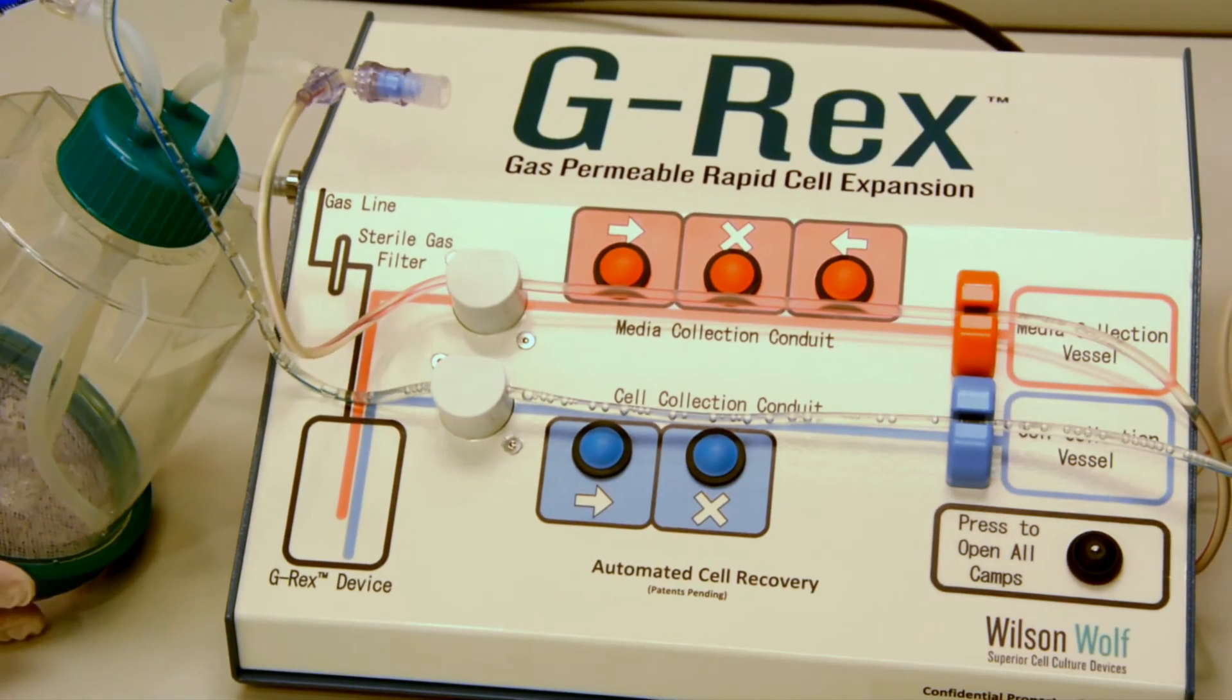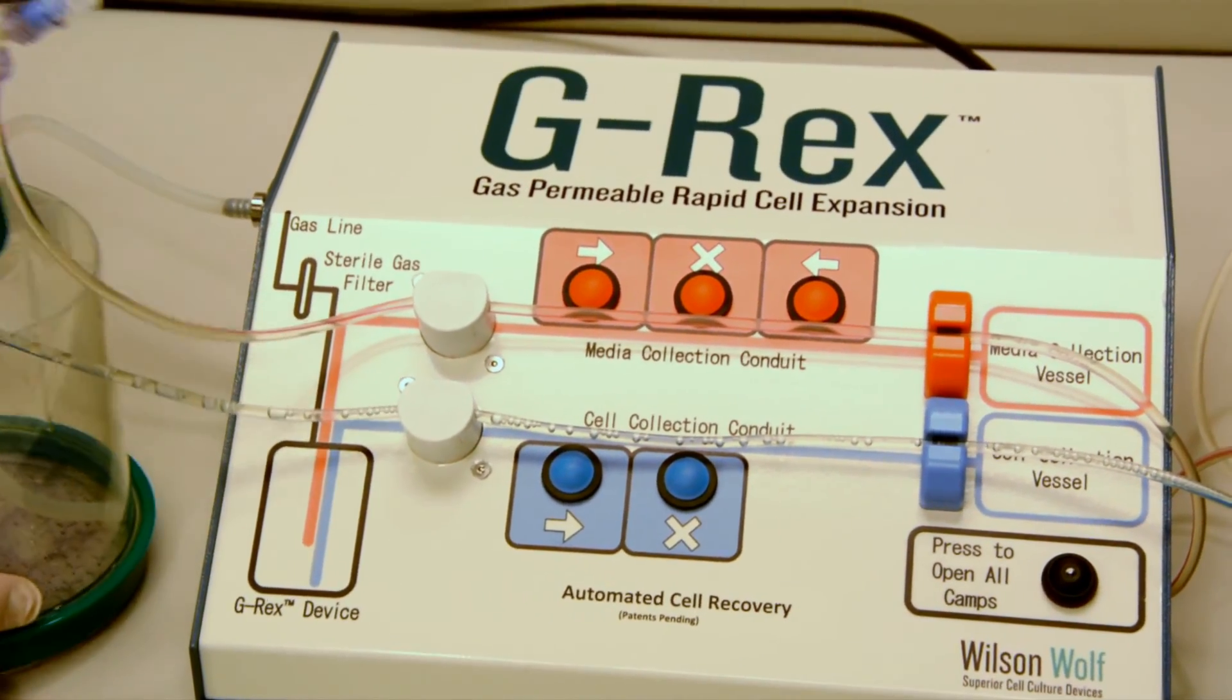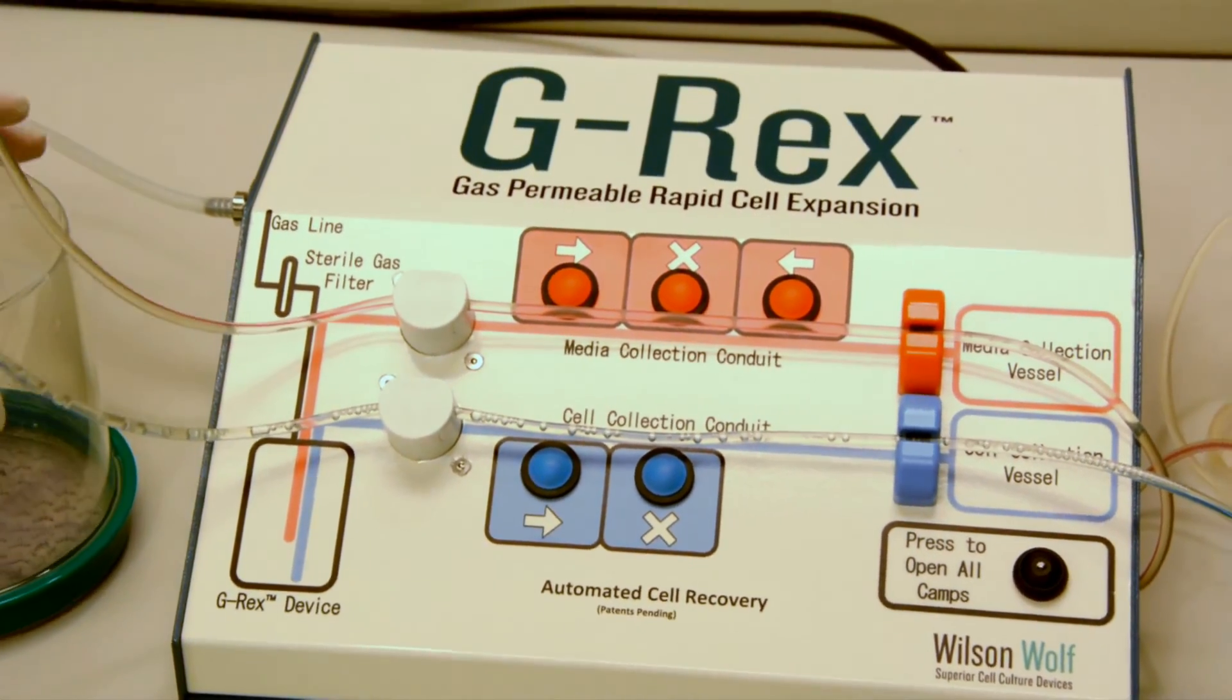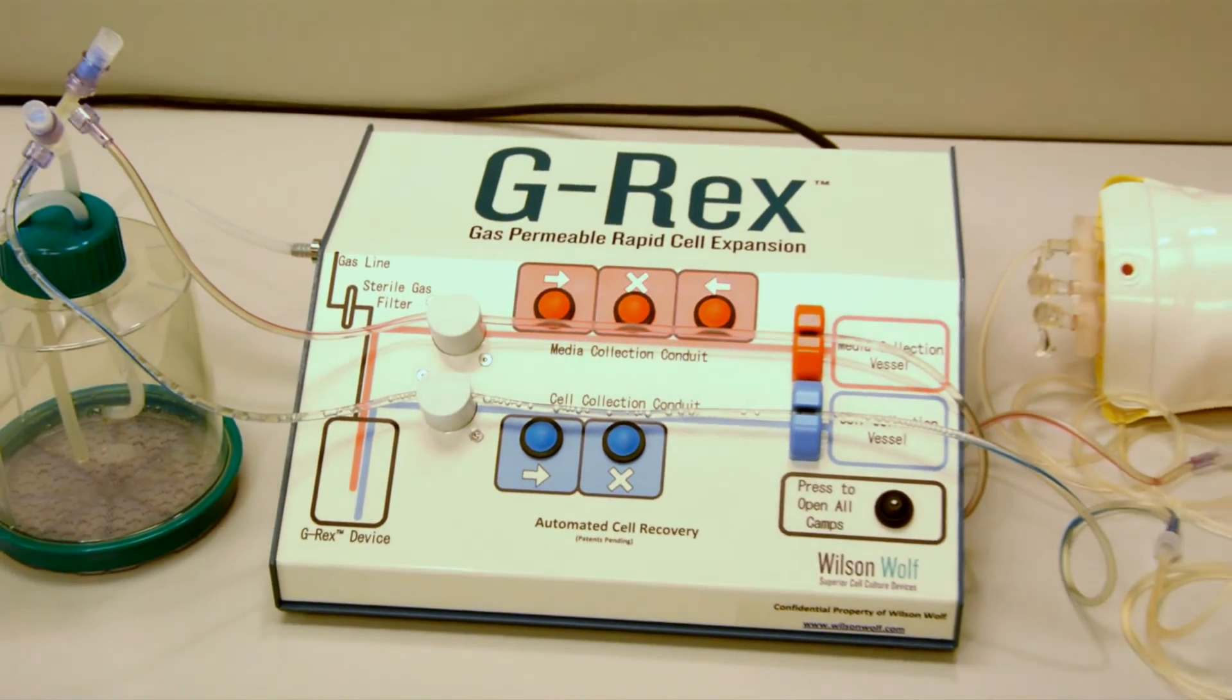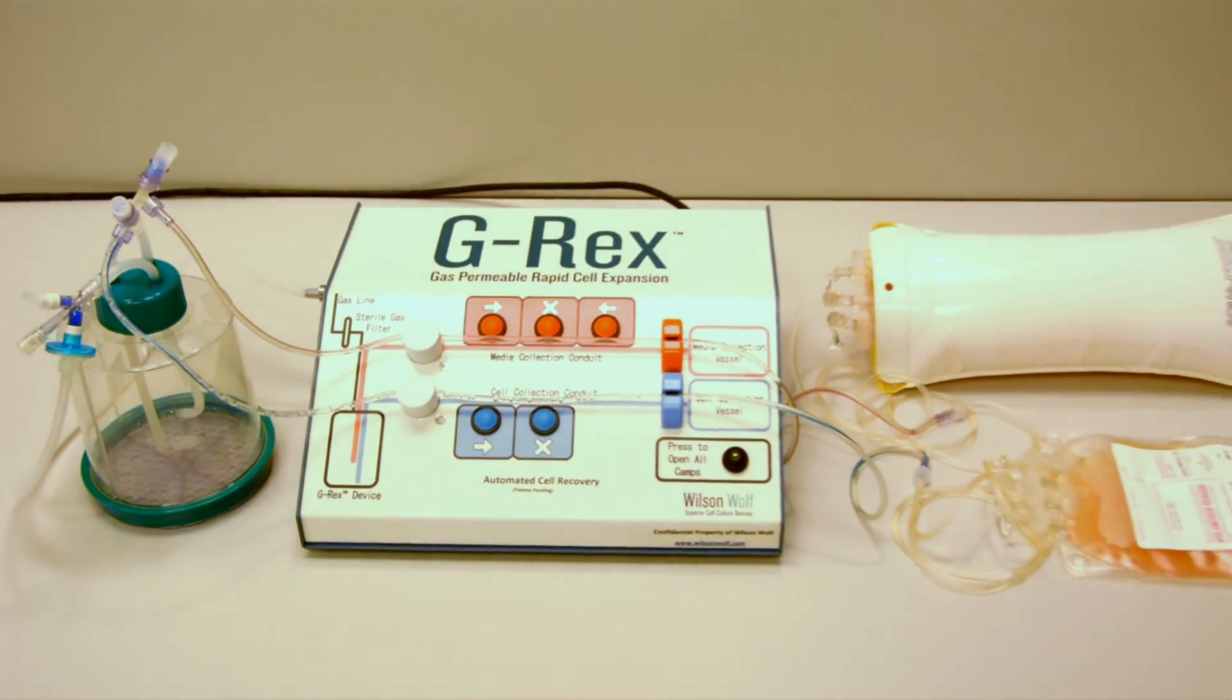This system allows the collection of a large number of cells in a volume as small as 100 milliliters in a completely closed system in well under five minutes.